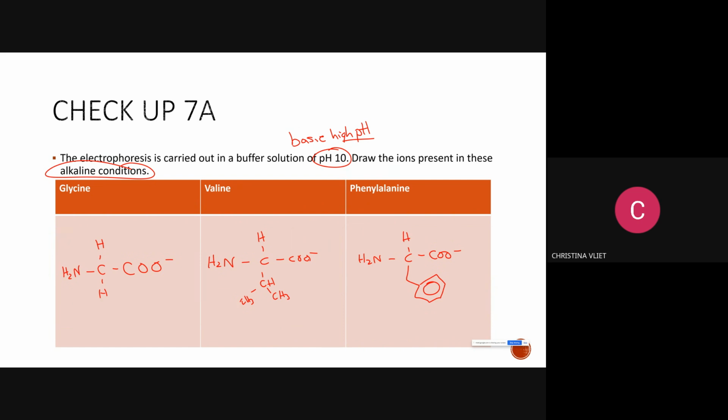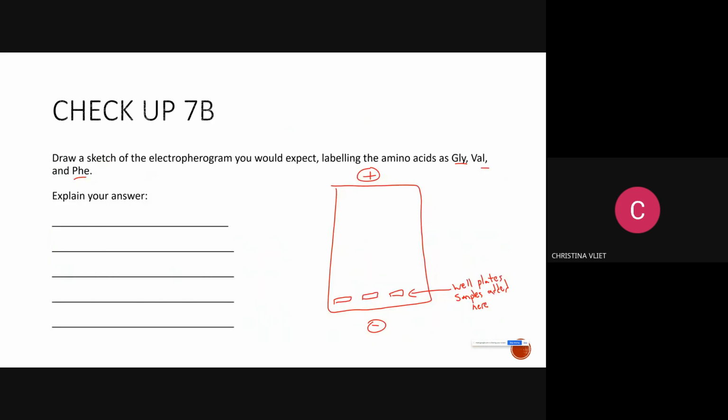Can you say that in a different way? So what are the two factors to consider before we answer the question? What affects how far they move? Issa, go ahead. The charge and the weight.